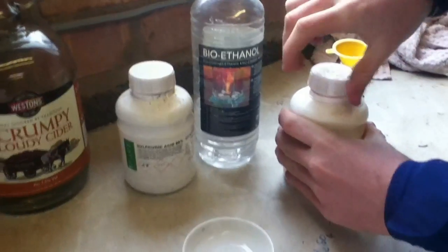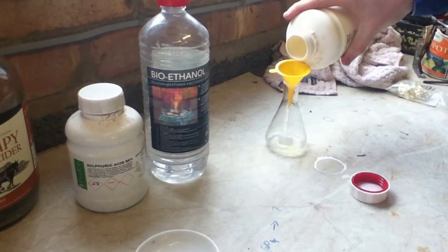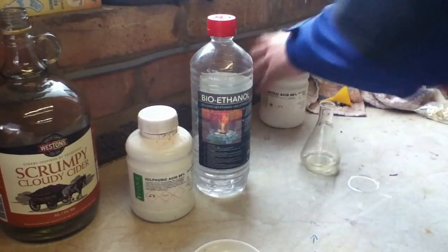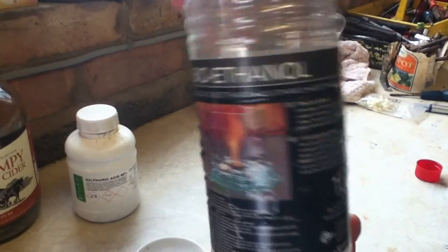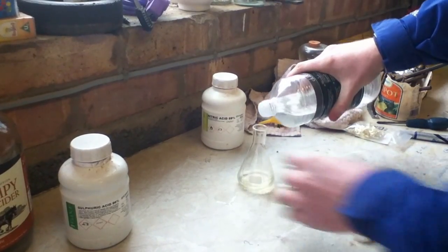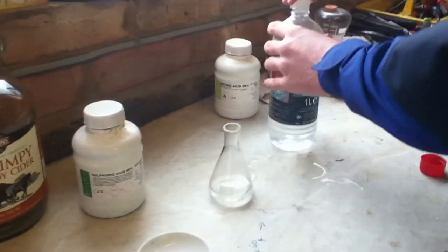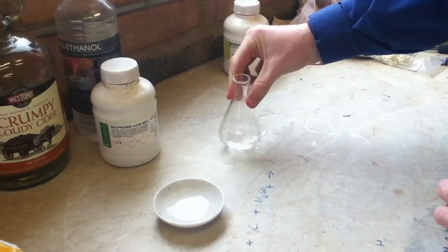Okay, nitric acid. Nice, pour a bit in there. Right, now what I'll do, take the funnel out. Remember to hold your breath. Ethanol — I don't know what the bio means. It's bioethanol. Now we've got a mixture. Apparently it's called Nital.